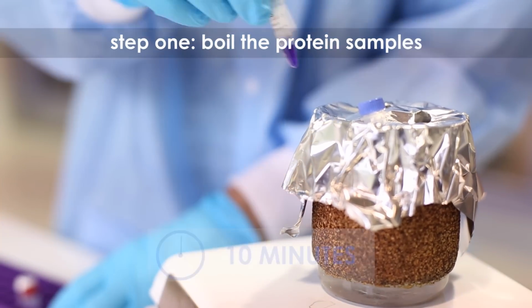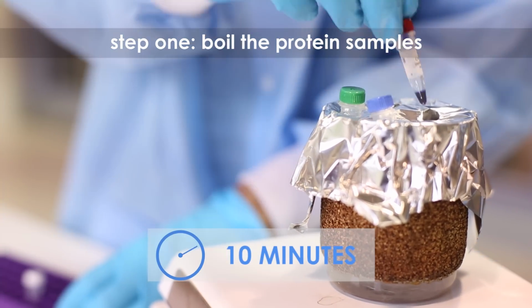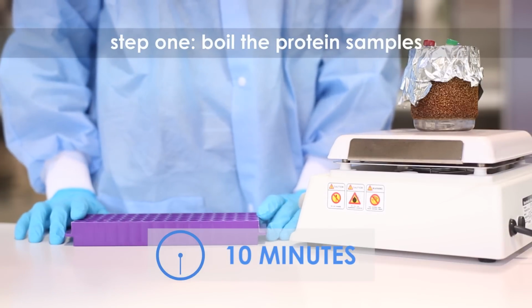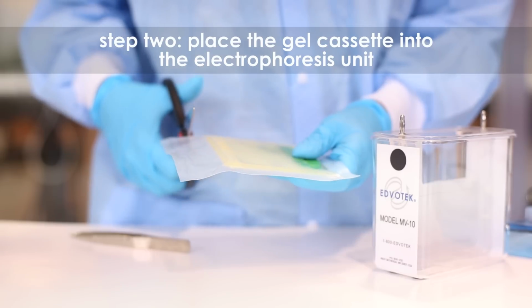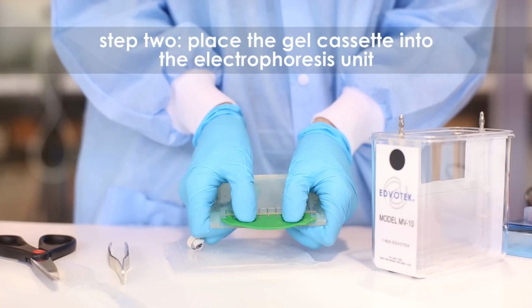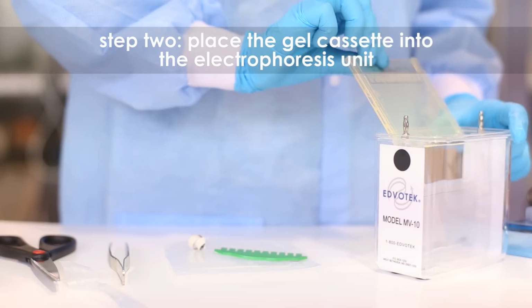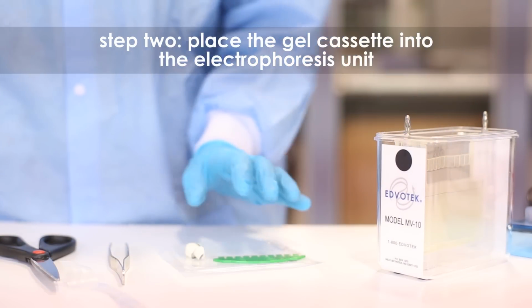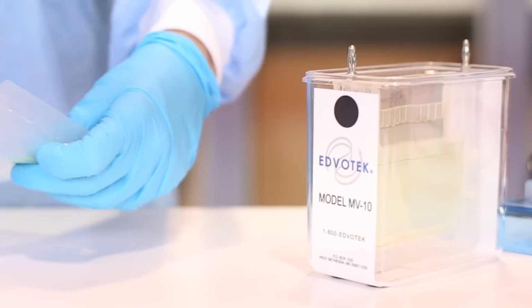Step 1. Boil the samples for 10 minutes to denature the proteins. Step 2. While the protein samples are boiling, place the precast polyacrylamide gel cassette into the electrophoresis unit. Follow the directions provided by the manufacturer to ensure that the gel cassette is properly oriented.